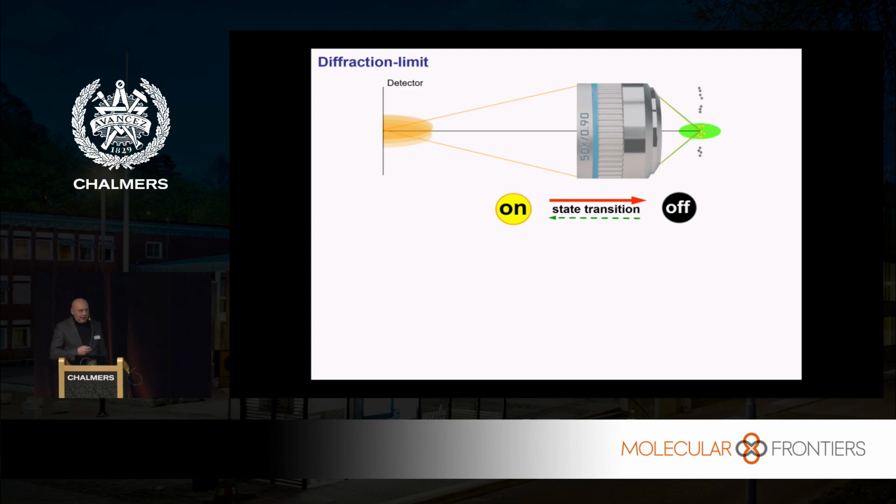Now, the solution to this long-standing problem in the end was very simple. Guess what it was? Just make sure that not all the molecules that are covered here by the light are in the end capable of scattering light back.